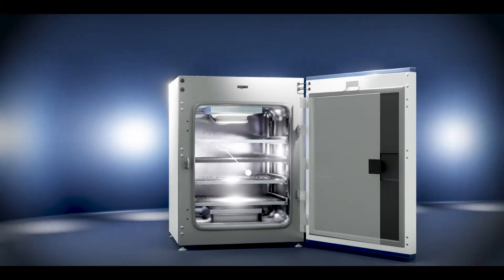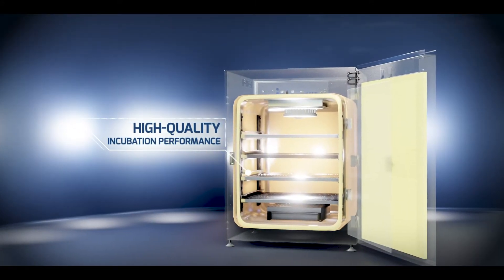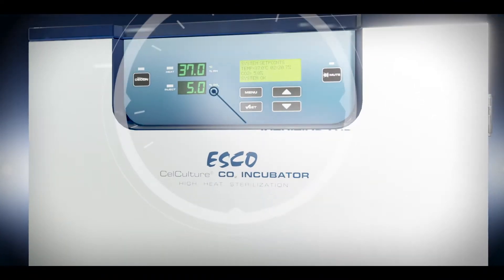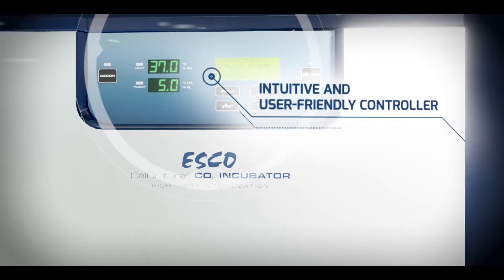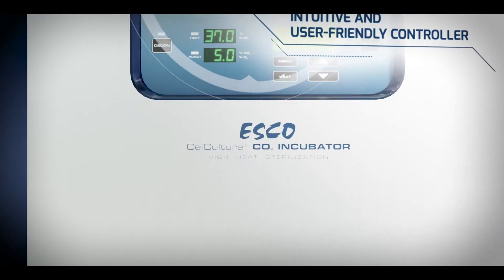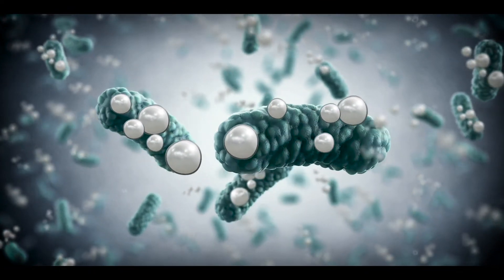Cellculture CO2 Incubator with High Heat Sterilization is designed for high-quality incubation performance. It has an intuitive controller with comprehensive user-configurable audible and visual alarms. Its external body is made of electro-galvanized steel coated with silver-ion-impregnated isoside antimicrobial powder, which kills 99.9% of surface contaminants within 24 hours of exposure.